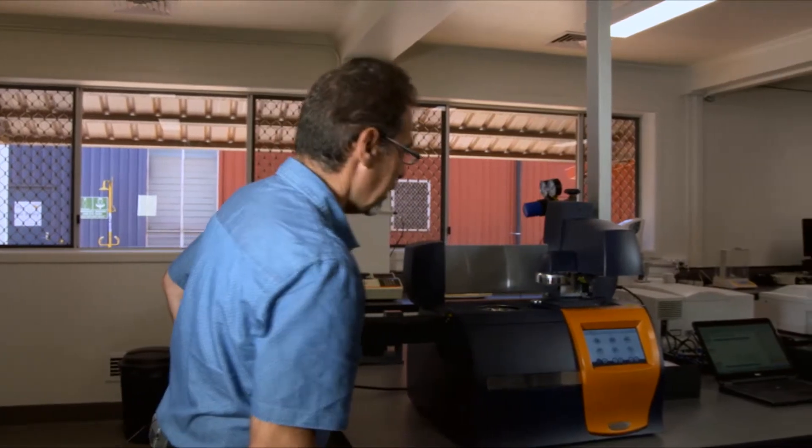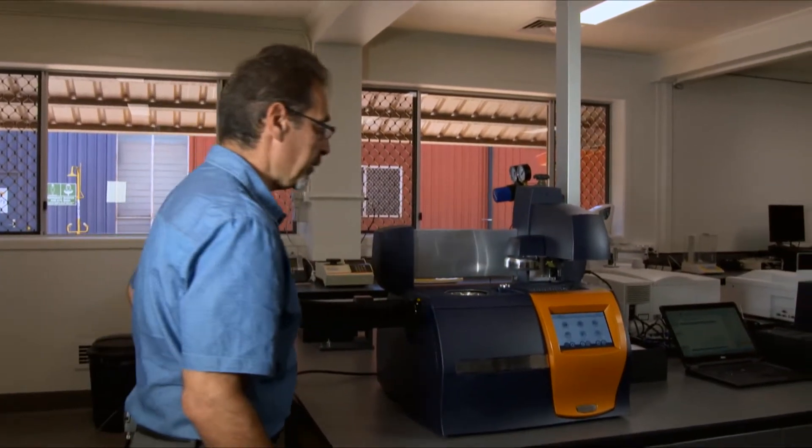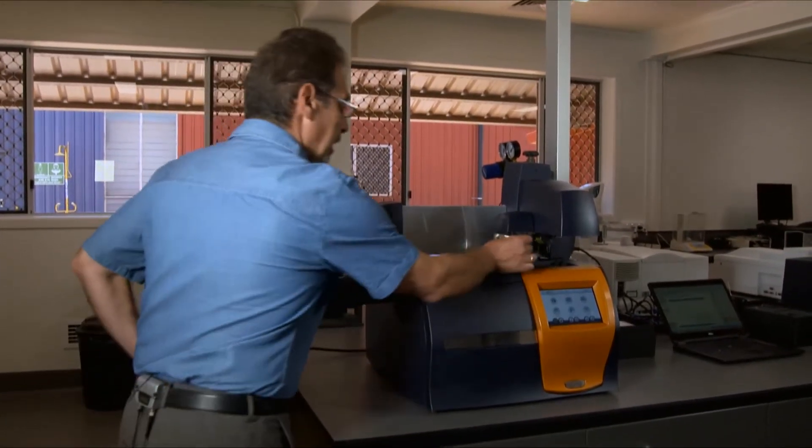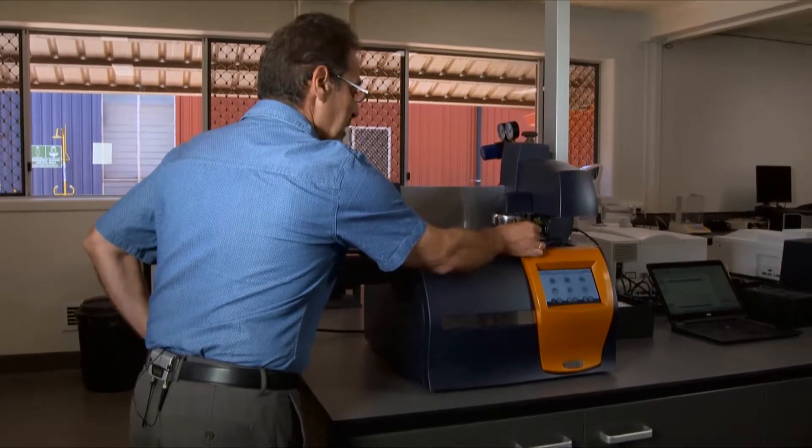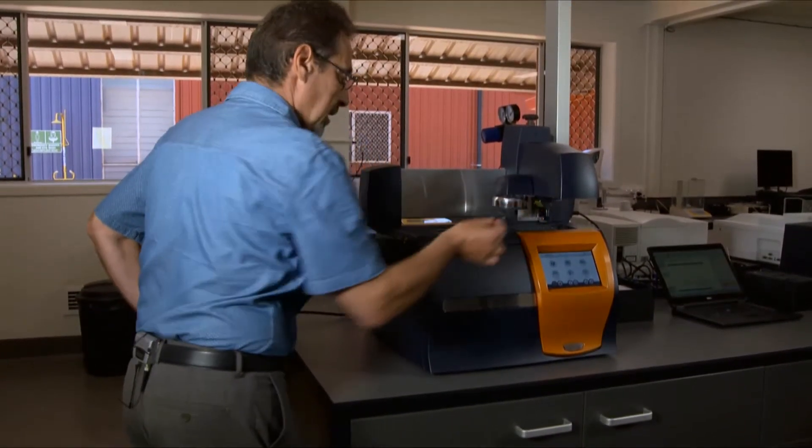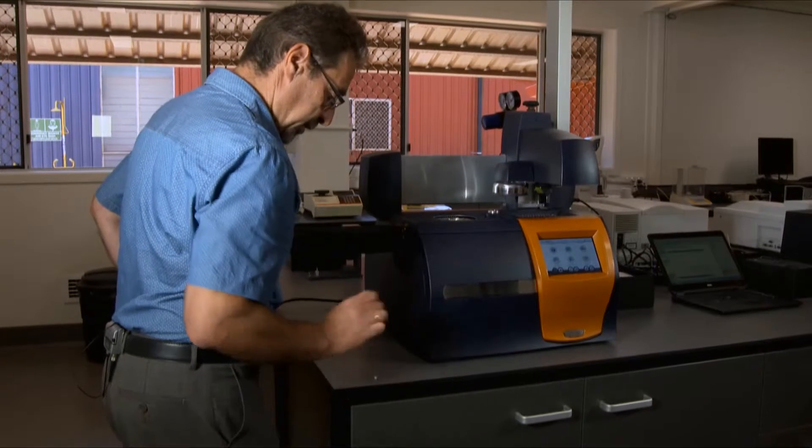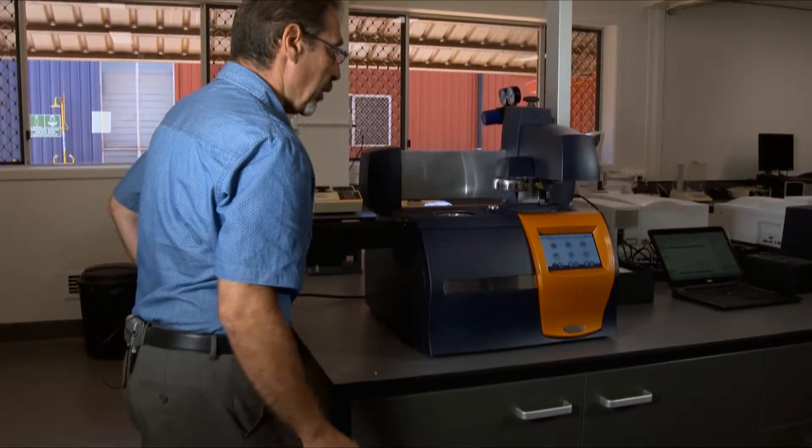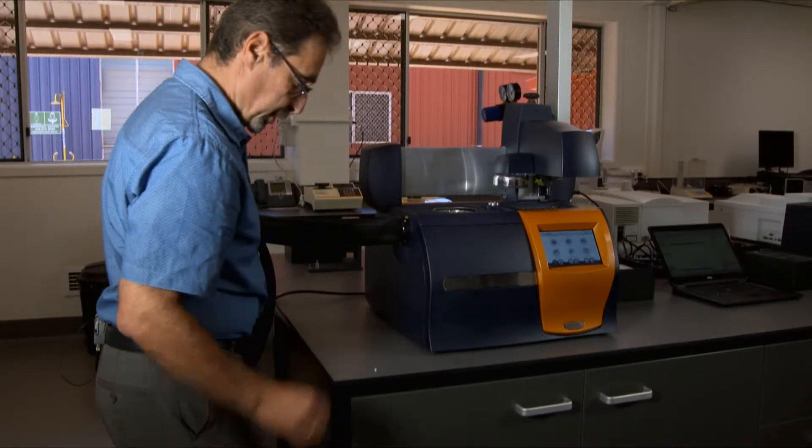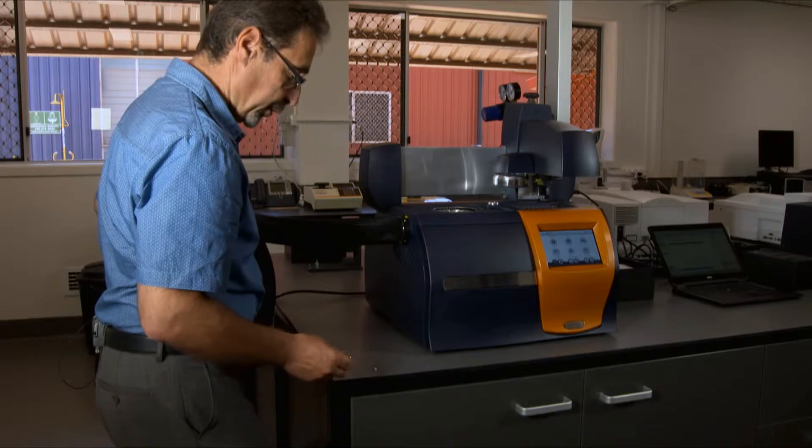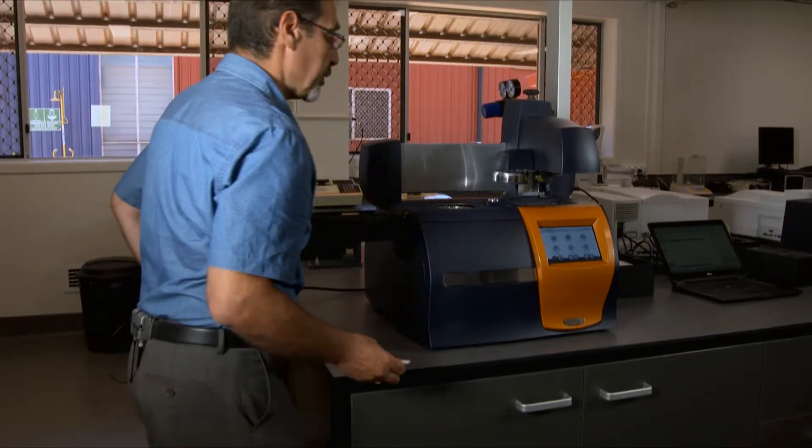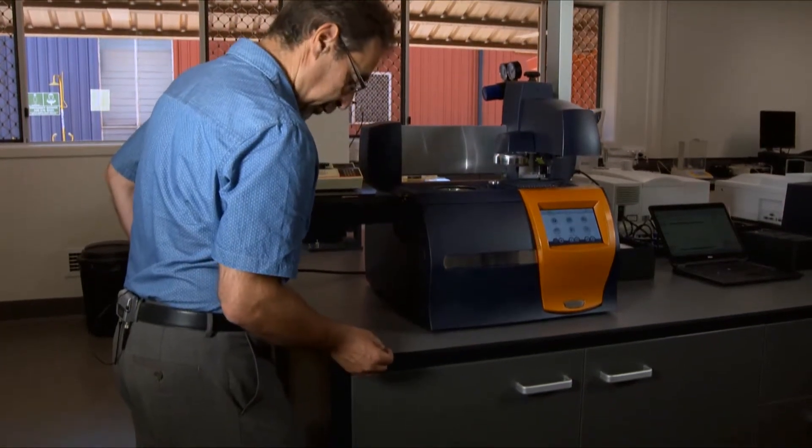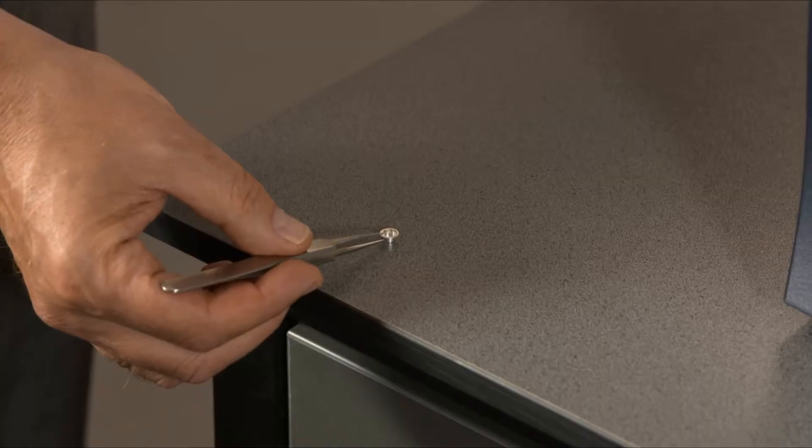Now, to run the instrument, we have to use aluminum pans. We're going to show you how to use pan and lid, how to use the press to put sample in, and how to set up an experiment to run it.